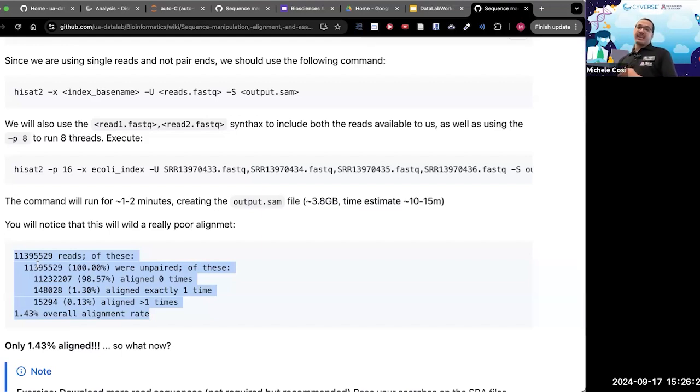Joel, yes, that's exactly it. We did not trim the reads. We did not prepare the FASTQ files for alignment. Because I did some looking into it, they do go ahead and trim the reads. They do it using Trimmomatic, which is a popular trimming tool. And they also use a different aligner, the STAR aligner, which may be a little bit more useful for this specific sequencer. So there are a few things that we have not done, and that is worth exploring.